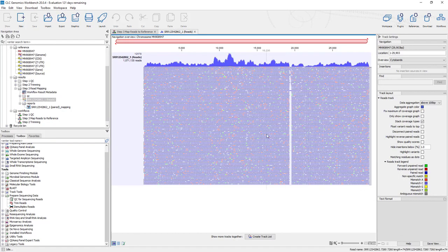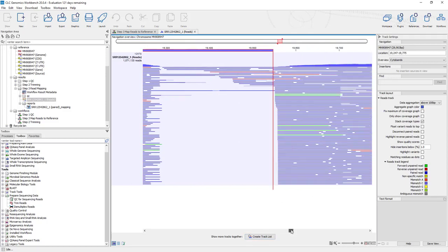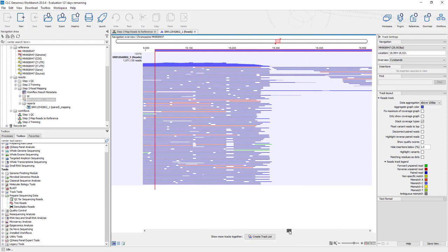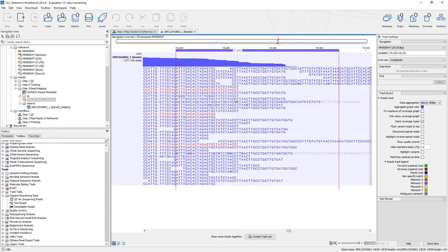Okay. And what's really great about the reads mapping view is you can go in and look at potential trouble spots here. So you can select a region in the mapping, and then you go down to the bottom right here, and you can see zoom to selection, and we zoom to selection. So you can see where an amplicon is dropping out there in the sequencing. So for the Arctic amplicons, this one, for some reason just isn't getting really good coverage, but you could also go in here and zoom into another region, and you can see the actual alignments here. So this is really, really nice.